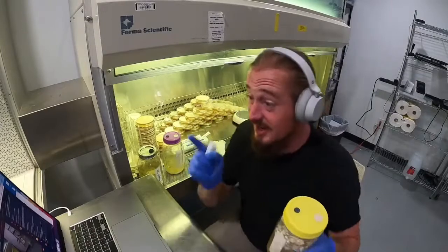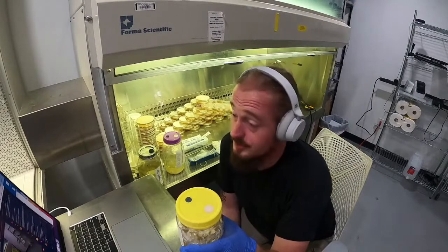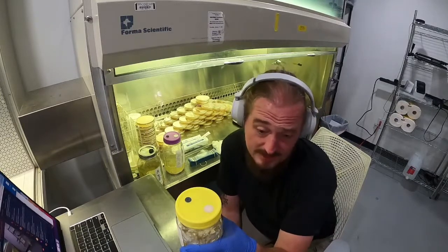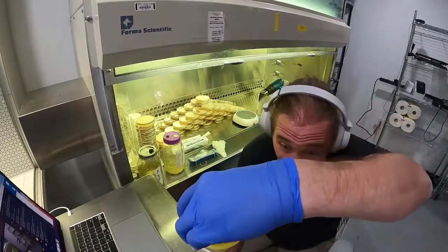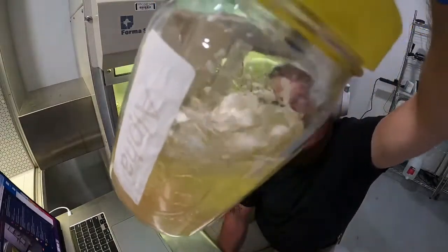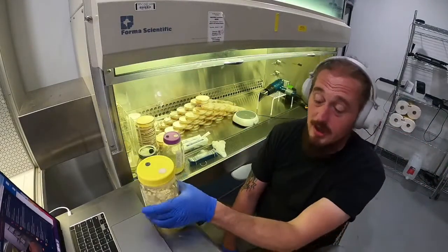This is why I say the way that you do things doesn't matter. So soy peptones and other things are great, but I like honey. Honey is naturally antibacterial and aseptic. It's very clean. And see that? Can anyone tell me what those are? All that little white peeking on that? Wait, hold on. I'll just answer the question.